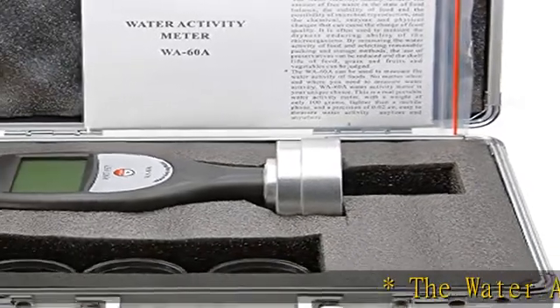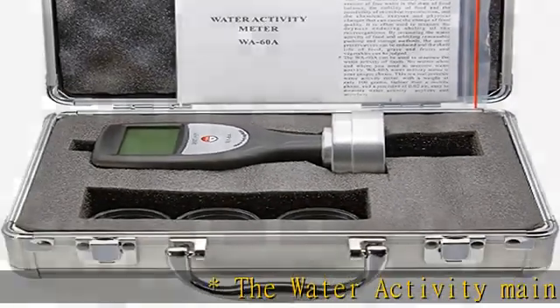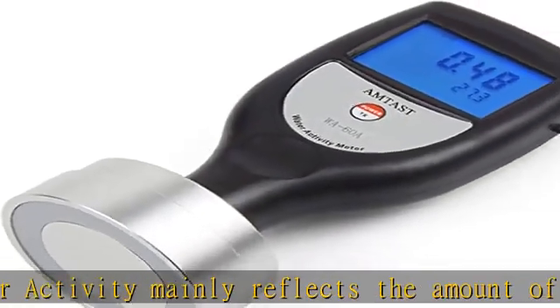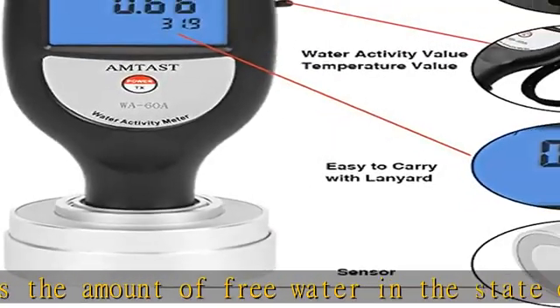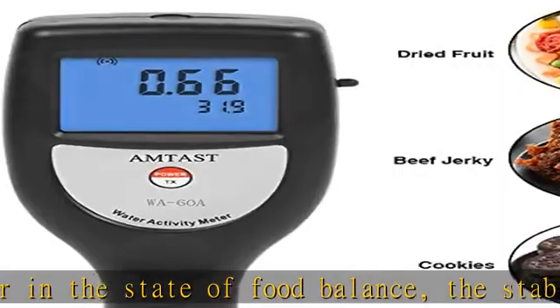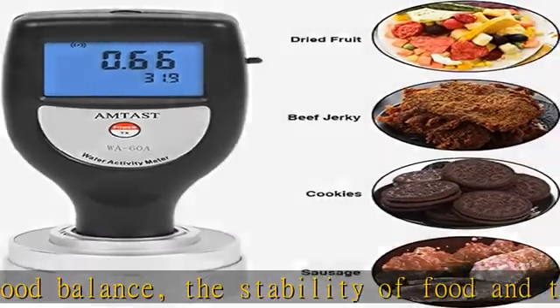Water activity mainly reflects the amount of free water in the state of food balance, the stability of food, and the possibility of microbial reproduction, as well as the chemical, enzyme, and physical changes that can cause the change of food quality. It is often used to measure the dryness and enduring ability of microorganisms.